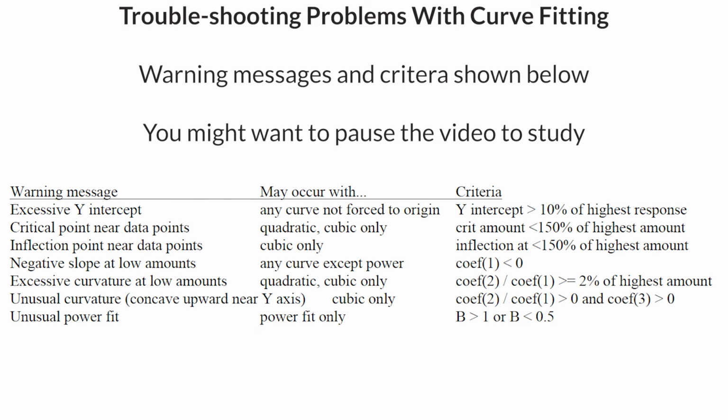Average calibration factor and point-to-point never generate warnings. Only the first warning is reported. Other problems that may be present will not generate warnings until the earlier problems are fixed.